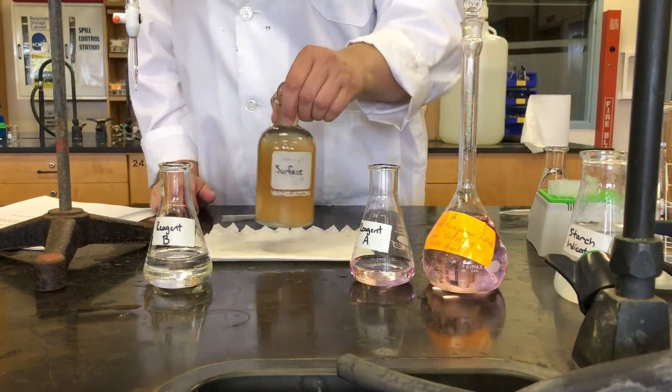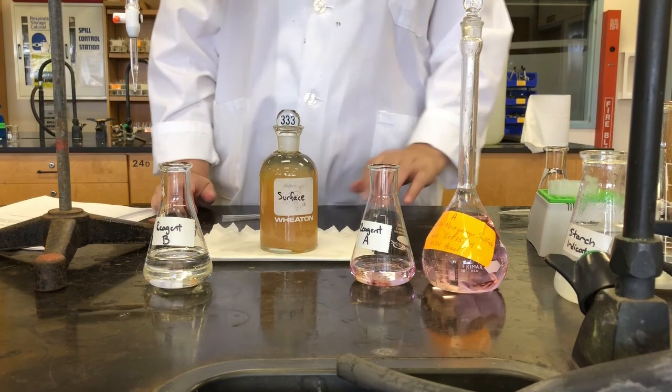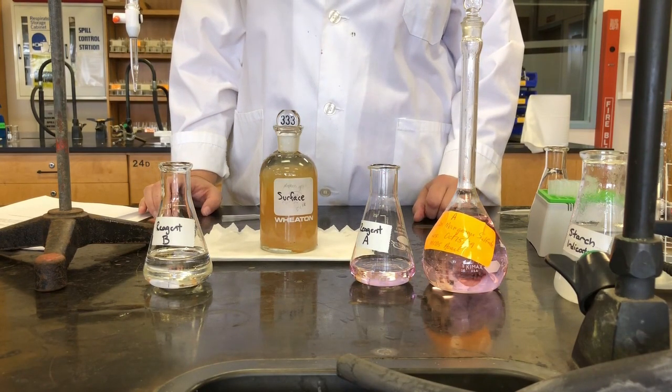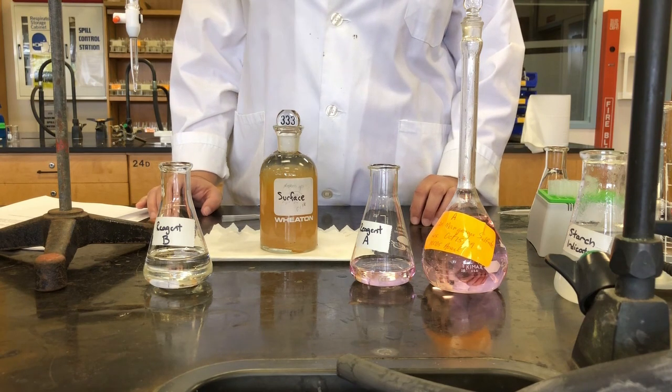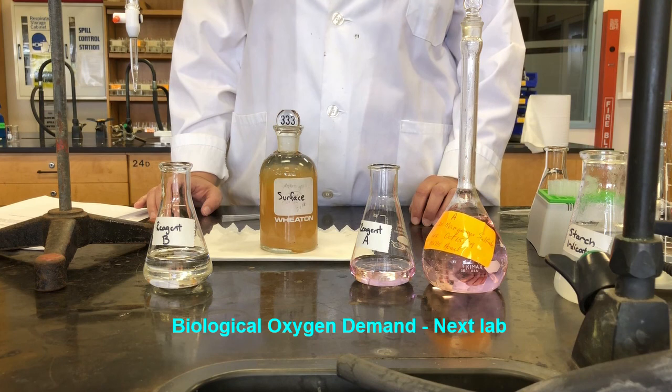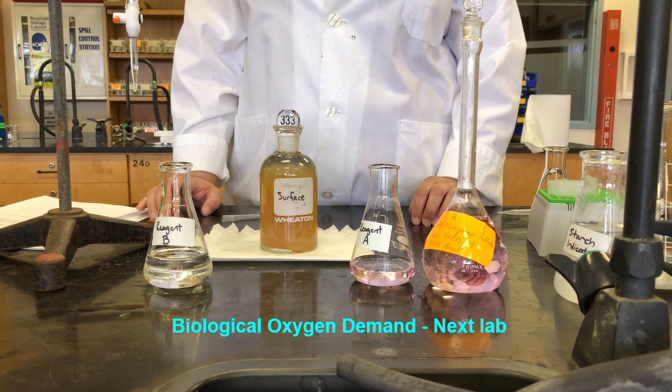So these are fixed now, so we can store these until we're ready to do our sample analysis. So I'm going to fix the rest of the samples, and we're also going to do some extra samples that we're going to use for BOD, biological oxygen demand, that we're going to test in the next lab. So those ones we're going to store in the incubator for 5 days.